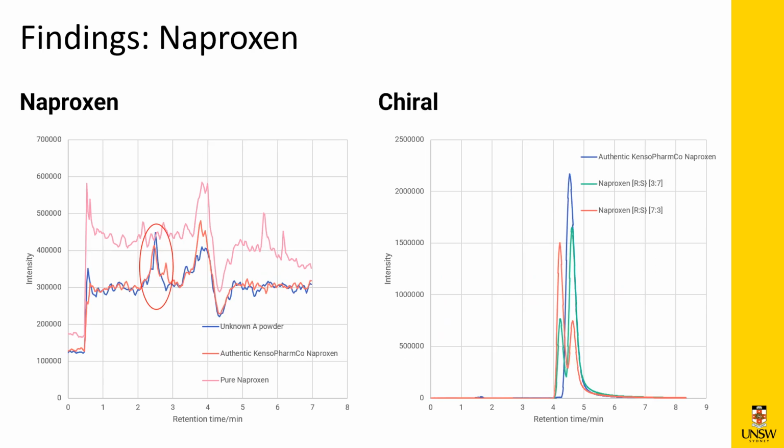Finally, naproxen samples have no particular concerns that are noticeable, though further confirmation will be required for the peak outlined. In regards to chirality, the S-naproxen was found to be the major enantiomer with no detectable signs of R-naproxen. No quality assurance was performed due to time limits, but good practice to be noted is performing more naproxen internal standards to properly assign the peaks.